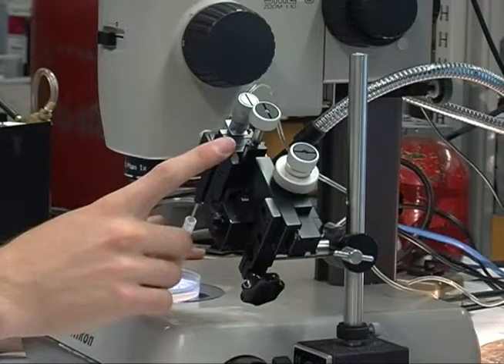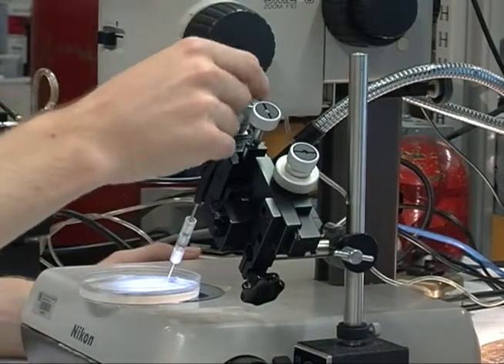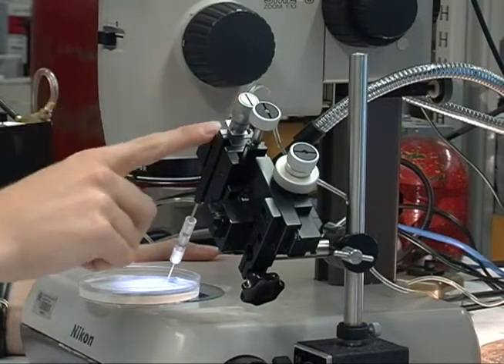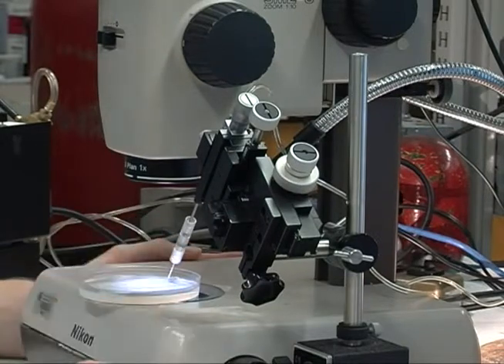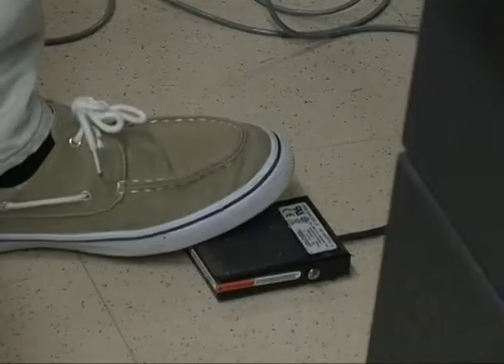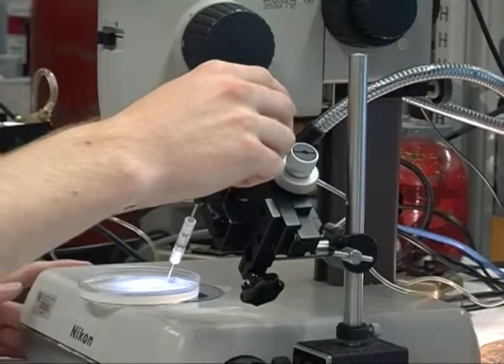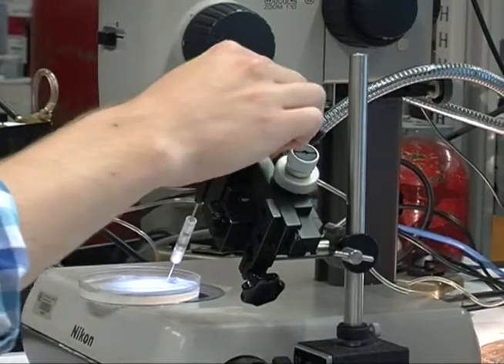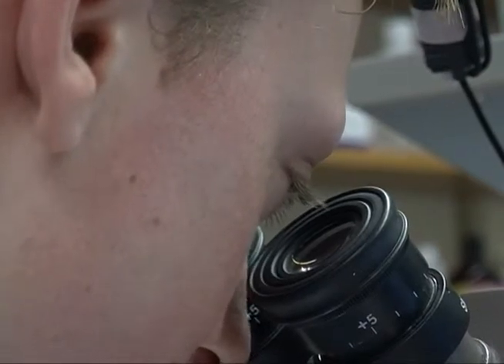So we have the manipulator, which holds the microelectrode, the small glass tube, and we have a tube that is attached to an air compressor. And what happens is that we force air through the tube, and it pushes a specific amount of chemical into each embryo. So the trick to doing this is we have a foot pedal that we use to supply power to the air compressor. And we look through the microscope, and we line up the needle with each embryo.